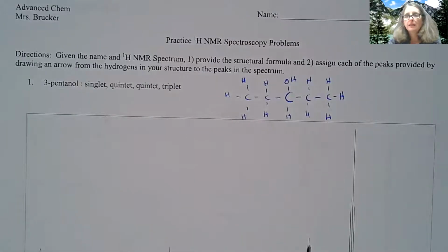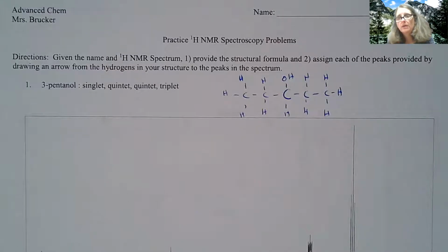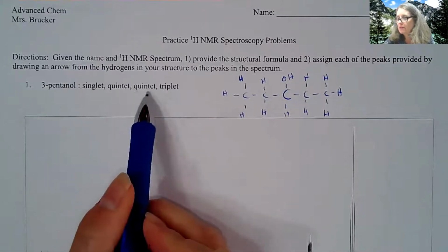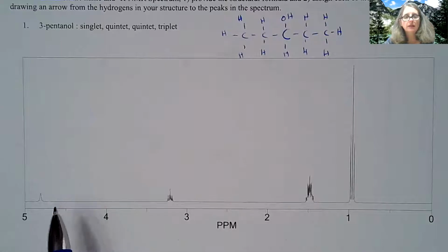But this packet is to help you get a feel for splitting patterns, and also where the peak would show up in terms of its chemical shift. So for this packet, you will be given a name, okay? And then you're going to be given the peaks that you have down here. So again, some of these peaks get a little yucky.